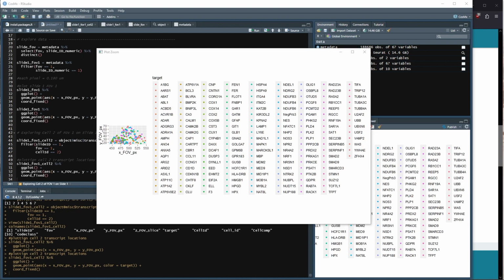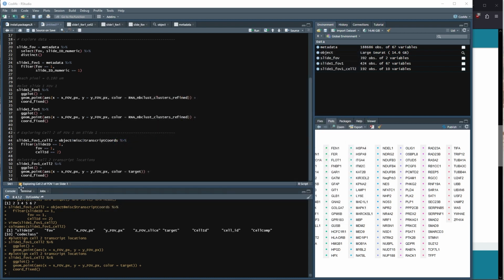Ooh, all right. Give me a sec. We want to remove a legend. Ah, there we go. It's in the theme, plus theme, and then we want to do legend position equals none.